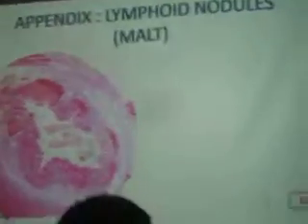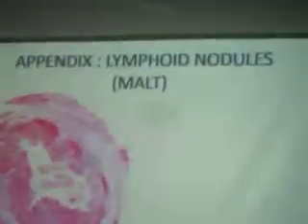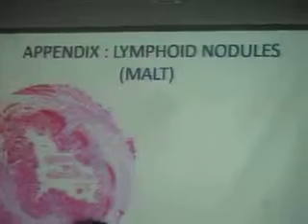It's another slide that we have. Peyer's patches, aggregated lymphoid tissue. Parang 25 times na ito. Another example of aggregated lymphoid tissue is your spleen. You will remember this, actually, appendix. You will remember that it is appendix. It is a cross-section, the only one that is a cross-section. It's hard to determine if it is longitudinally cut.